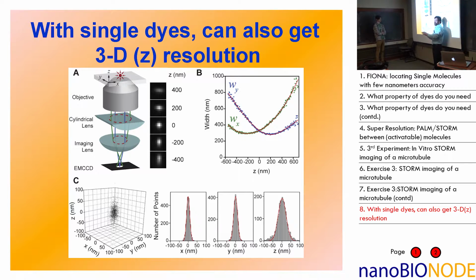So that's now a given. At 200 nanometers, what you find is that the ratio of y to x is, I don't know, about 2. Then you keep going. You do 300 nanometers, you do 400 nanometers, and you find that ratio is about 4 to 1. I'm making things up.